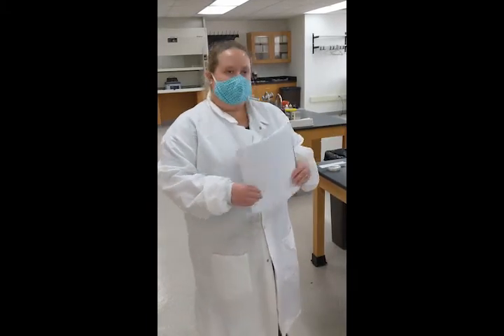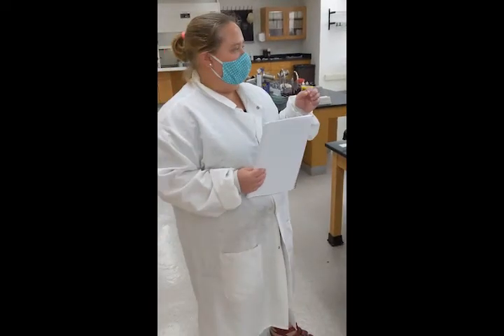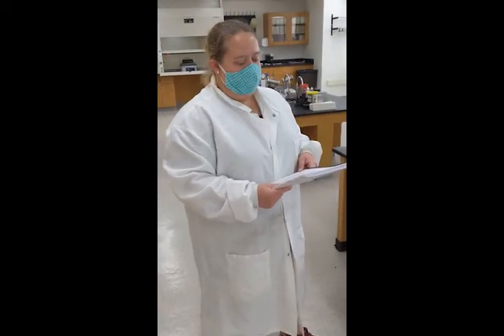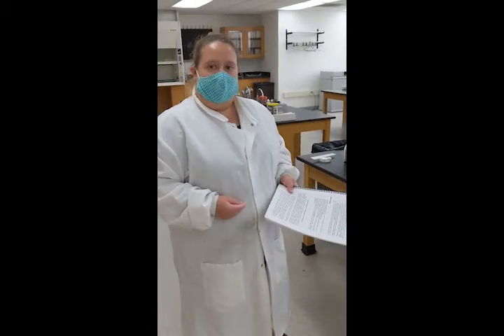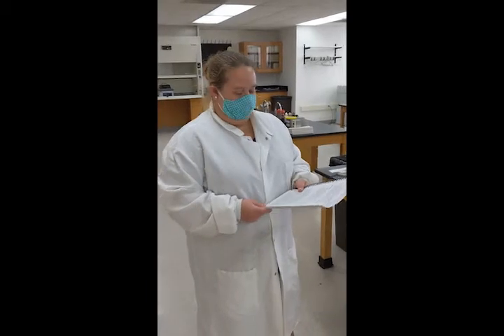The last thing we want to do is make sure that you label your cultures with marker. You can label your test tubes directly with a marker, and you can also write directly on petri plates with a marker. Every culture must be labeled. You should also make sure that you remove any unnecessary books and personal items from your work area. The only things you really need in class are your lab manual, a notebook, and something to write with. You do not need a laptop and should not have phones out — you don't want to potentially contaminate any of your electronics, and it is very hard to sterilize these objects if they were to get contaminated.